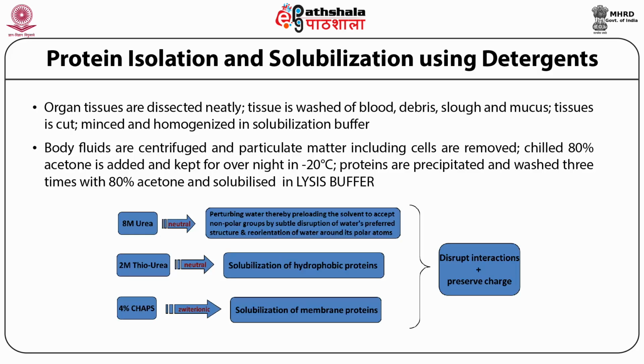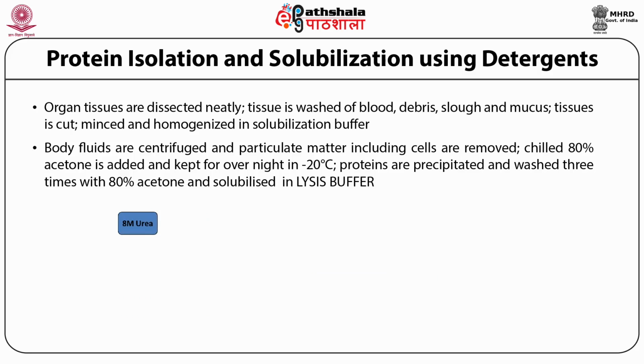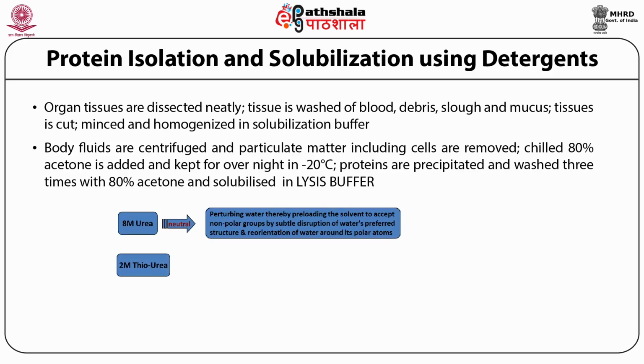Effectively, the combination of these three reagents helps to disrupt the interactions that stabilize protein structures and thereby makes it that much easier to solubilize the proteins. However, this particular lysis buffer helps to solubilize the proteins but preserves the charge on the proteins that is so very essential for isoelectric focusing.